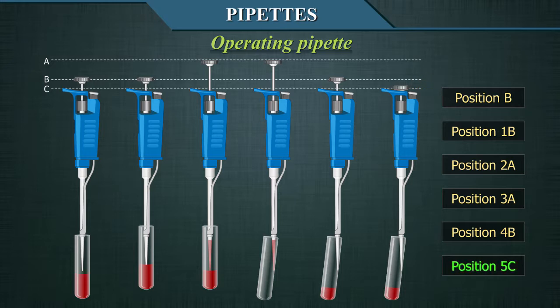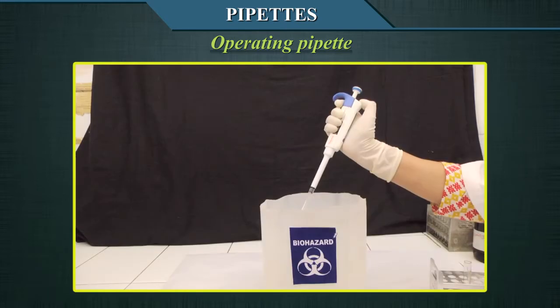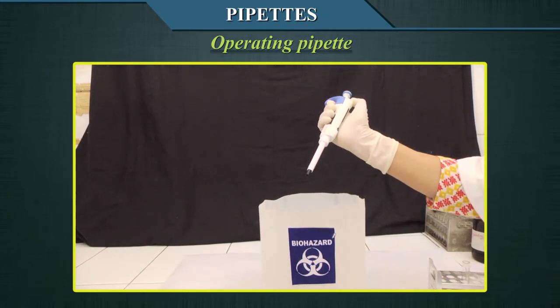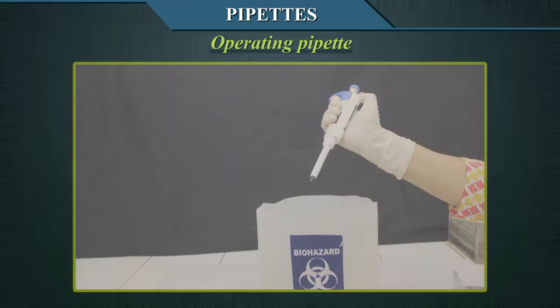Press the plunger gently until it reaches the second limit on the piston's path. This expels any fraction of liquid still in the pipette's tip by forcing out the air in the chamber through the tip. Keep the plunger pressed at the second limit while the pipette is removed from the receiving tube. Once the pipette is removed, gently release the plunger to the blank position. Then discard the pipette's tip by pressing the expulsion mechanism button.